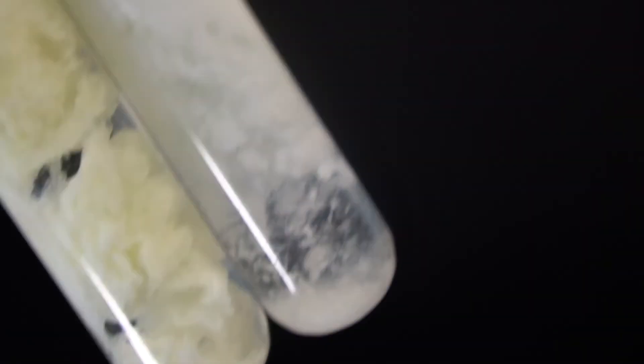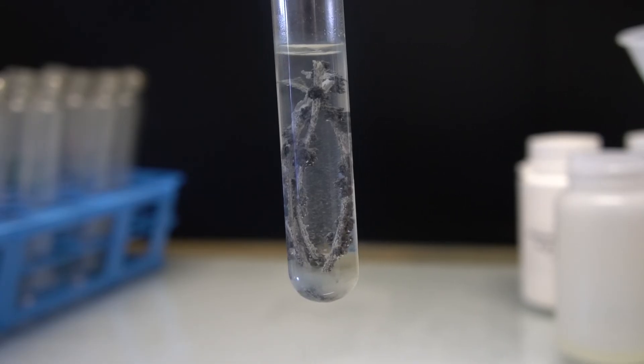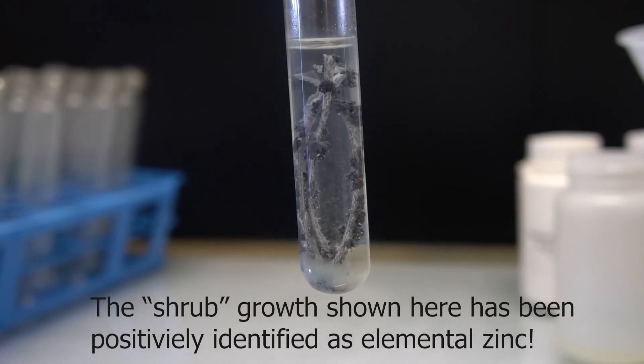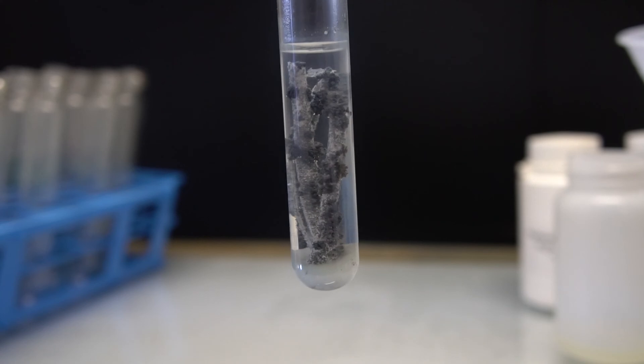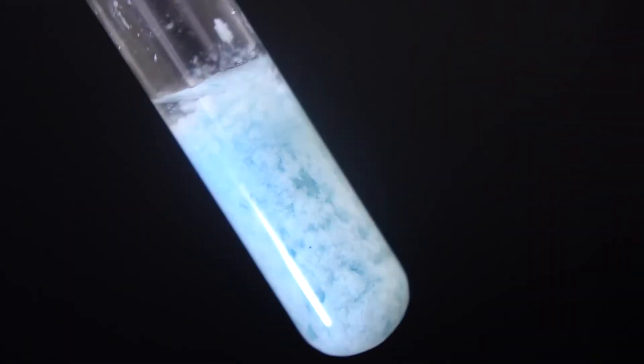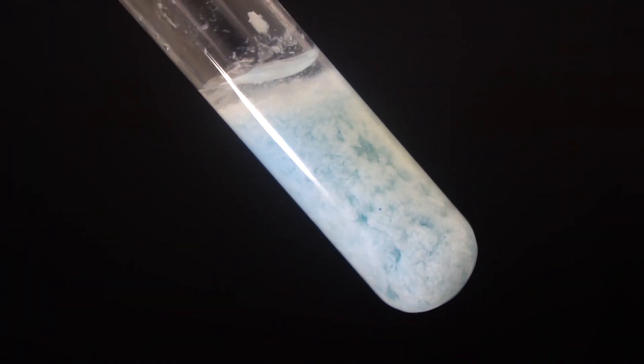The slight blue color in our final zinc ferrocyanide preparation was most likely from iron and copper impurities in the magnesium ribbon. From what I can tell, we are one of the first groups to ever show this reaction happening, producing elemental zinc without electrolysis. This is really interesting because it opens up a potentially easier method of producing elemental zinc.